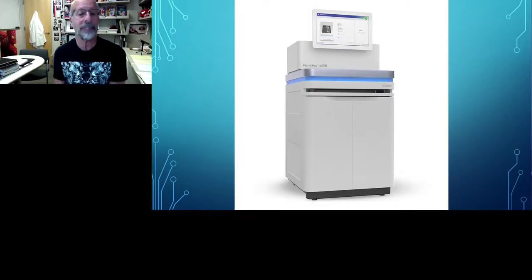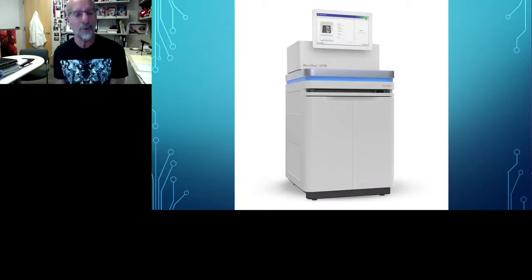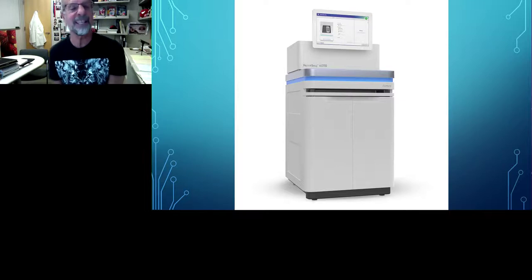Today, the penultimate Illumina sequencing machine is shown here. This is the NovaSeq 6000. This machine is capable of running, I'll go back a slide, this machine is capable of running 3 different sizes of flow cells. Their highest output flow cell is capable of generating 6 terabases of sequence output. So every time you run this machine, it produces 6 terabases of sequence output. This is an improvement from less than a gigabase to 6 terabases, a 6,000-fold improvement on this single platform.